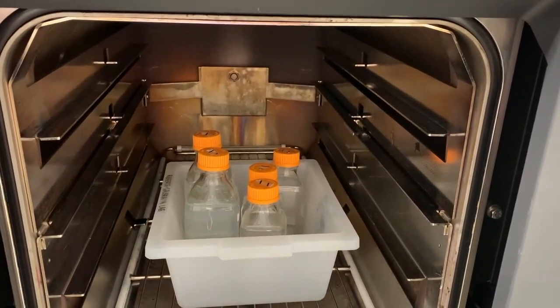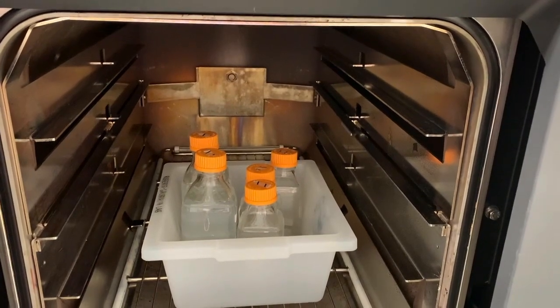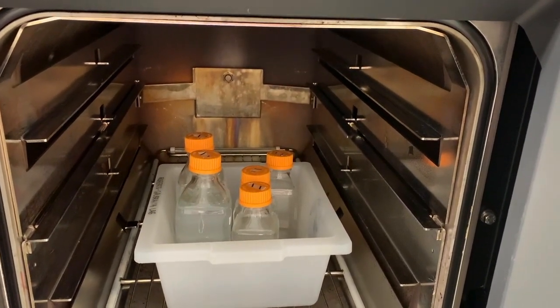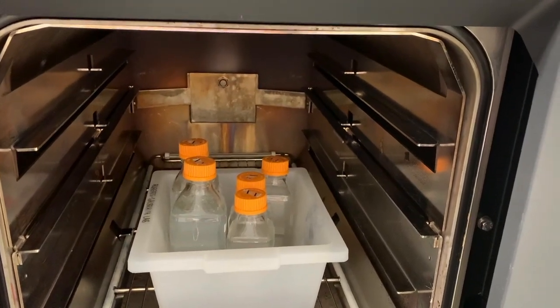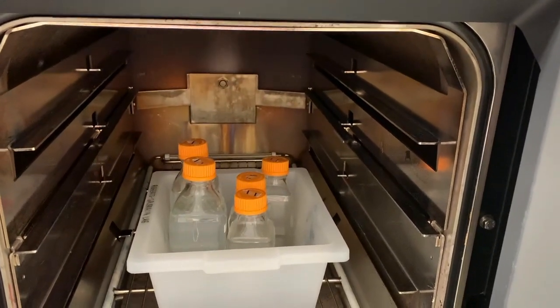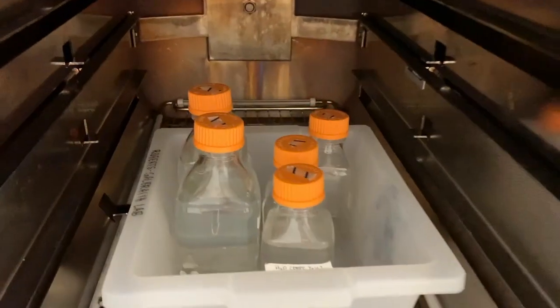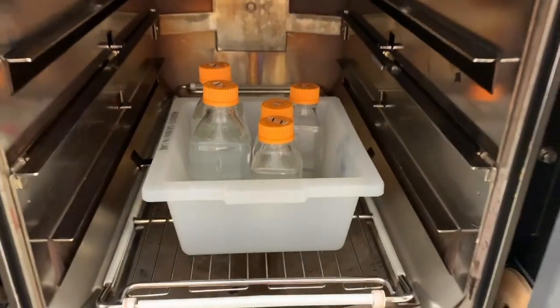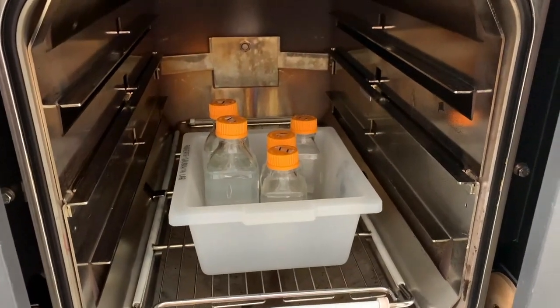And then I usually let my solutions cool before sealing the caps. Otherwise, you'll actually create a vacuum so that when you open the bottles again, they will suck in air. And these solutions are now sterile. You can see on the lids there are darker lines on the tape. And these solutions, once they're cooled, can be ready to use.